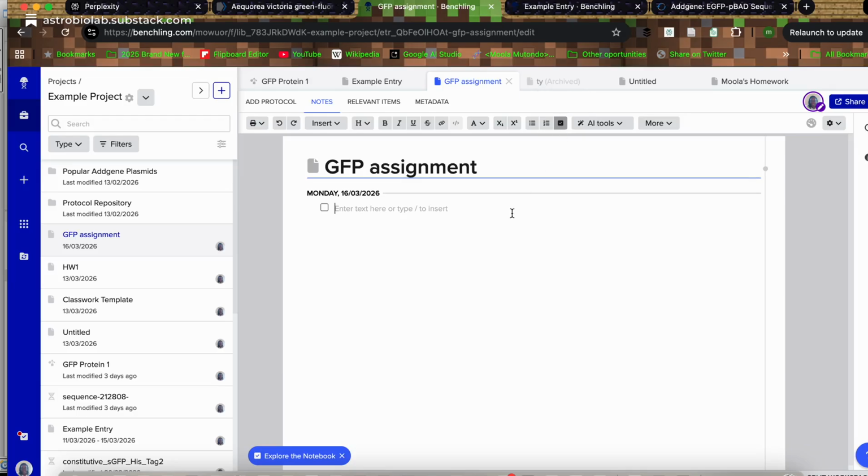What do I have to do? I can consult the actual homework, and it said something like collect the sequence from NCBI. Then I had to import it into Benchling, and it needed to be circular, I think. Visualization. And then there was the primer story as well.